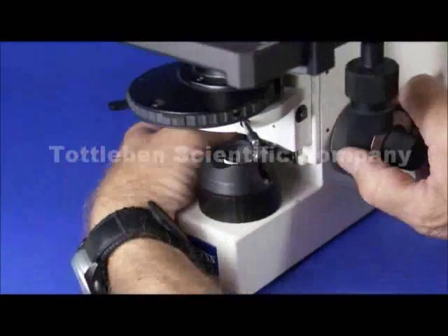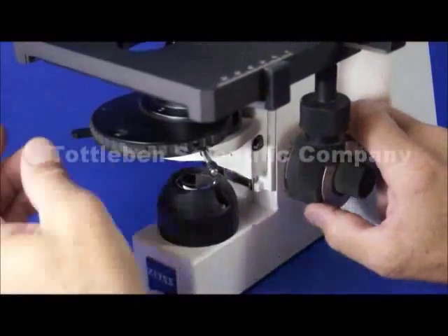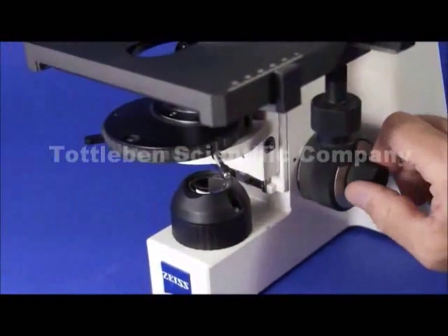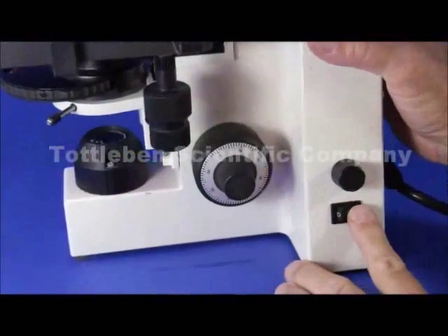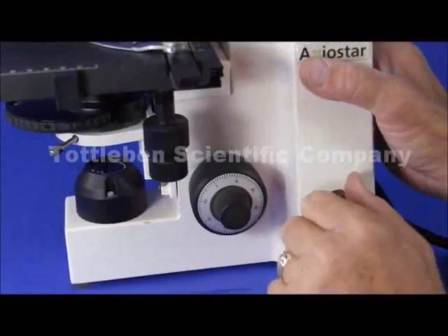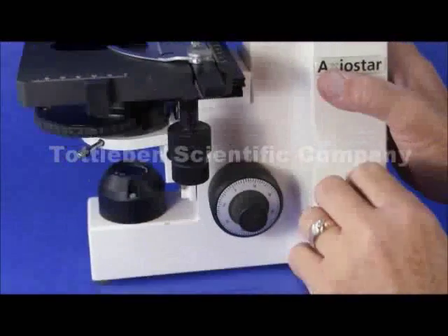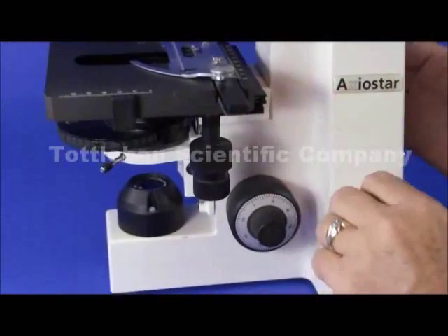You have coaxial drives on each side of the stand for both coarse focus and fine focus. Over here you have the on off switch. And you have the rheostat control for controlling the intensity both increasing it and decreasing it.